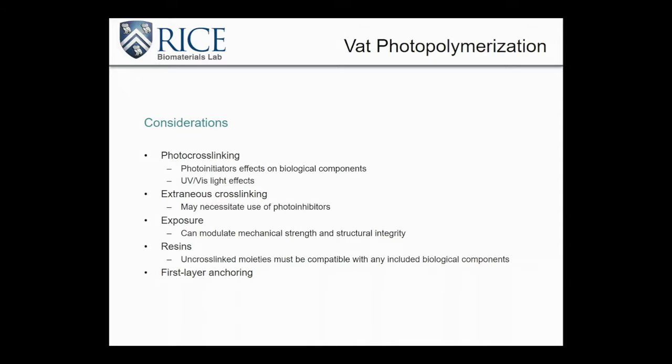So it's not just the UV or the visible light irradiation we're worried about, but also what cross-linking agents we're using and how biocompatible the material is for our cells or our growth factors before we even cure them.